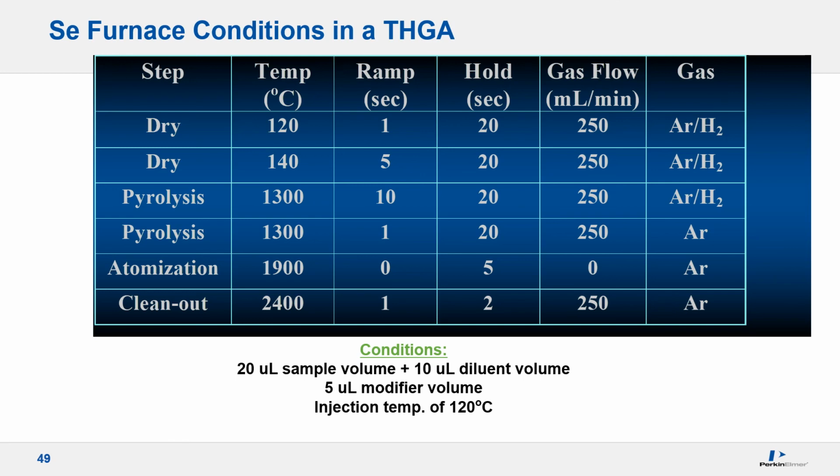In this case, we add a dummy char step with the same temperature as step 3 with a 20-second hold time designed to replace the mixed gas with just argon for atomization and cleanout for the same reasons mentioned on the previous slide.